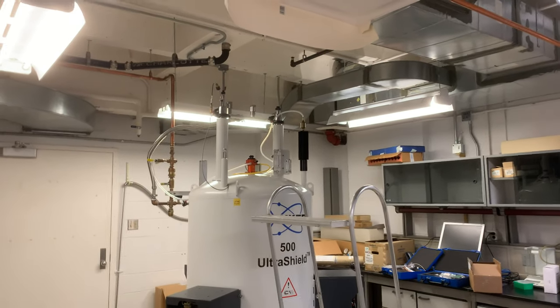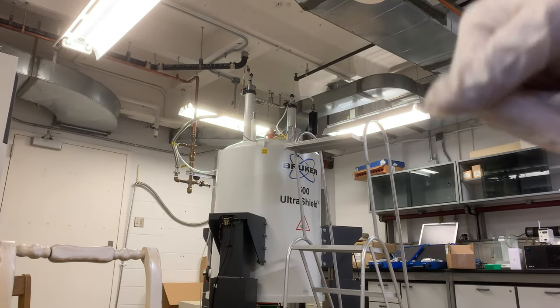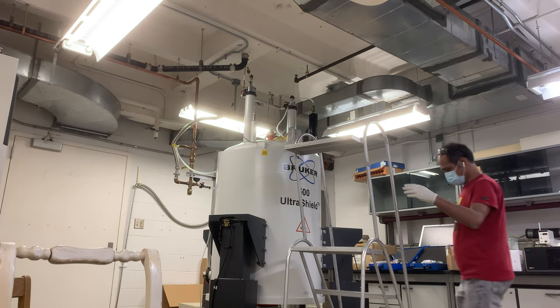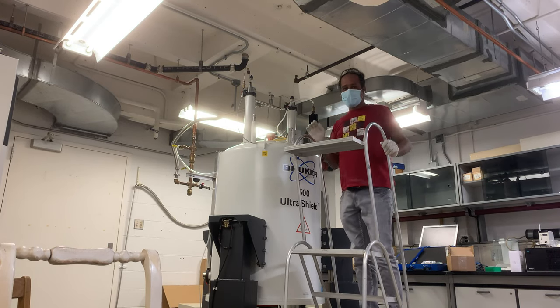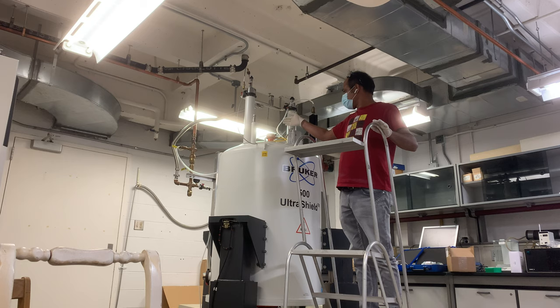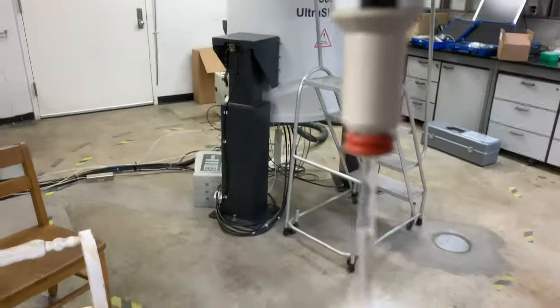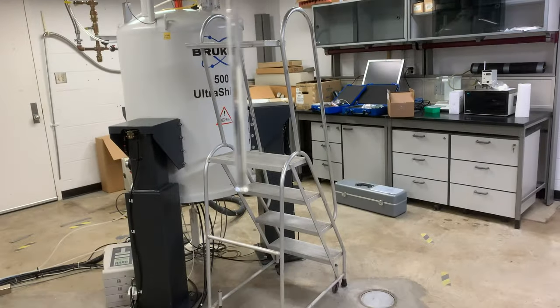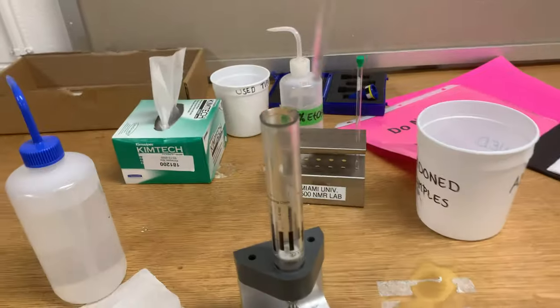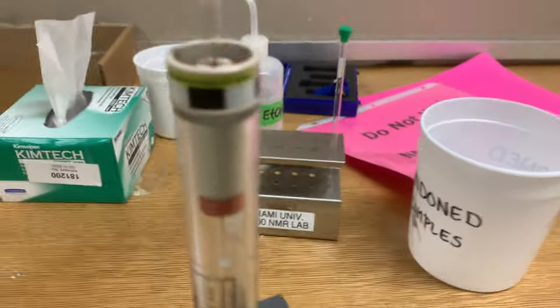I need to remove this cap, then it will be ejected. This is the dummy sample, which always stays in the NMR. There is a sample holder, so I need this spinner. This is the spinner.